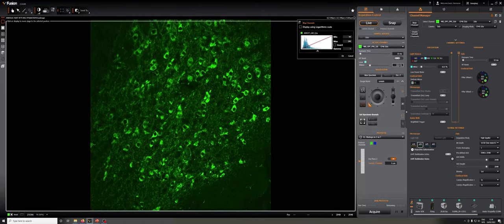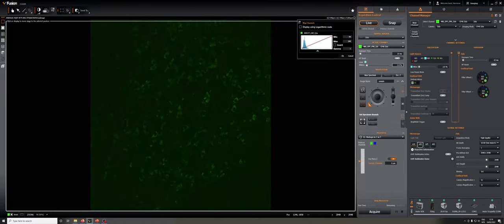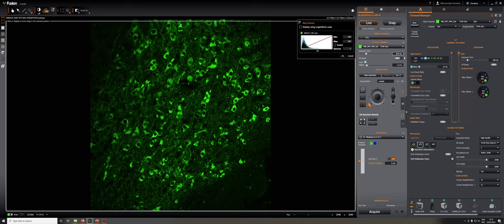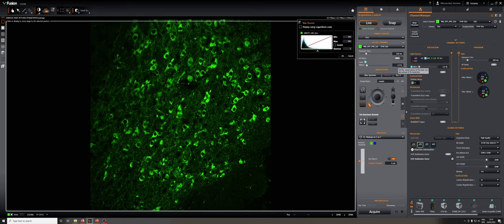So I'm going to lower the laser down to something more reasonable. I'm going to turn auto back on. I'm going to go to a longer exposure time. And I'm going to discuss one last thing with respect to exposure and laser power, which is this low power mode. If you want to lower the laser below 2%, which can be a good idea if you have a bright fluorophore or something in a live cell which is very sensitive, you can't — this slider only goes down to 2%. If you want to do that, you have to engage this low power mode.